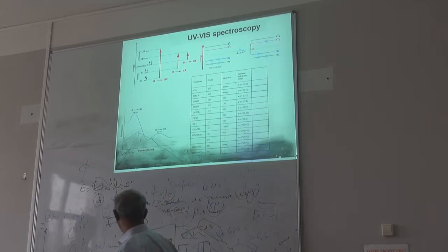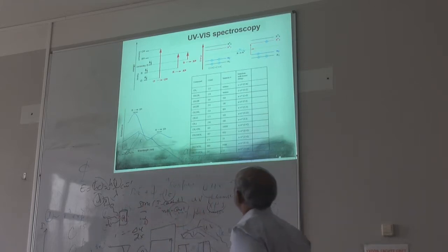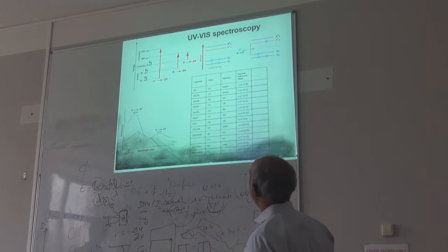In that case, you look at what is reflected to your detector. You have no transmitted term here. So if you look at R, you can get information about what you measure, which is typically absorption. Here I'm looking at typical molecular bonding and anti-bonding states.